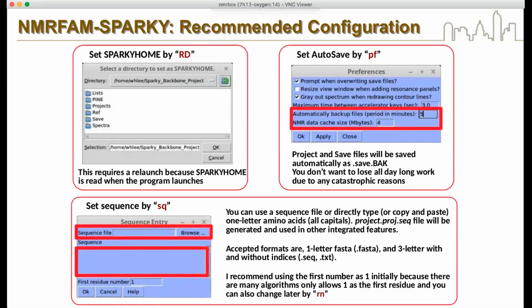You can increase it in case you are working with non-uniform sampling data, such as files a lot larger than a few gigabytes, where you want to increase it a lot. And I'm not sure in our box how much is allotted per user, but I think it's going to be fine if you set it to 128 or 256. But your performance will be a lot faster than the default.